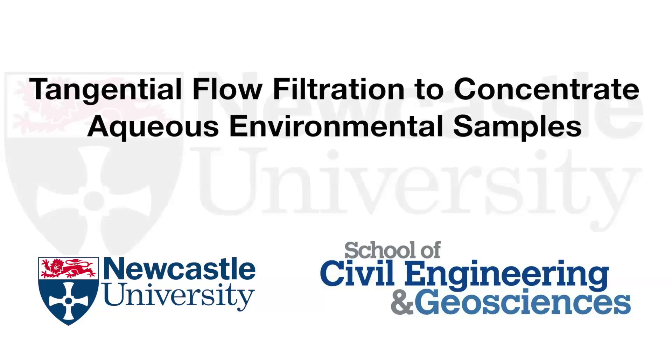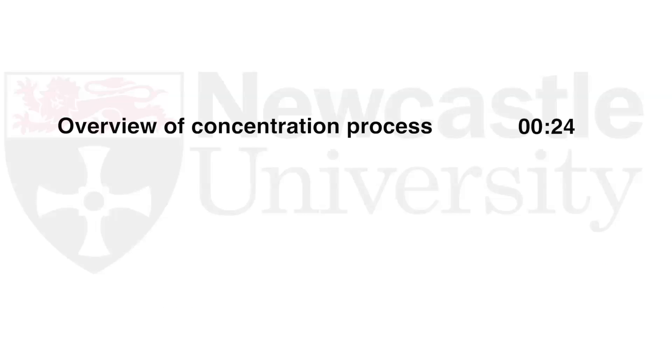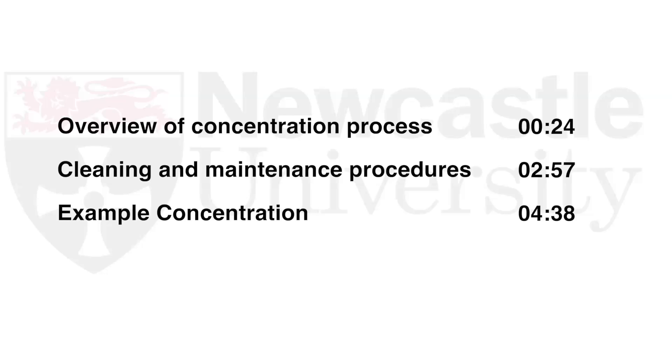This video will demonstrate the use of a Millipore Pelican Mini Tangential Flow Filtration or TFF unit for the purpose of concentrating bacteria in aqueous samples. An overview of the concentration process will be given, followed by cleaning and maintenance procedures and finally an example concentration of 5 litres of environmental sample.